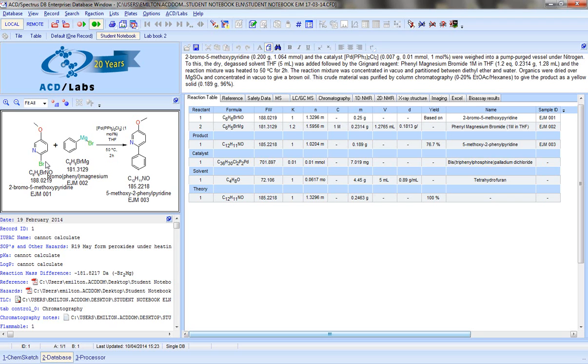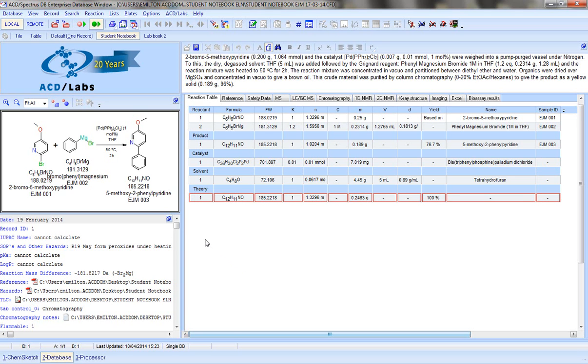As you can see, we have a reaction scheme shown on the left-hand side that can be easily edited and put into journal format within ChemSketch. We have the reaction protocol associated with the reaction shown above the reaction table.